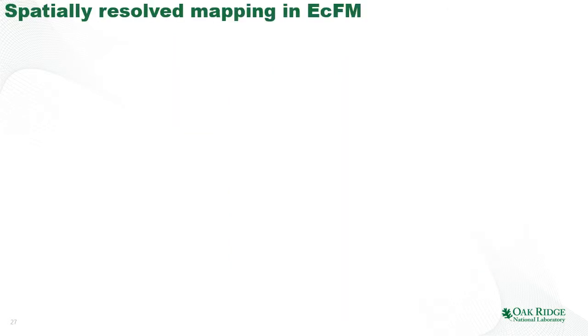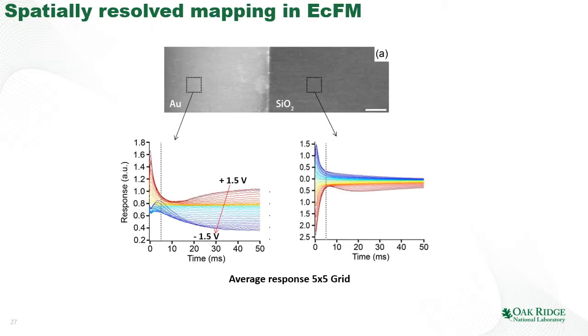Question is, can we even call this method microscopy? What I've shown you is an example of single point measurements, and as I said, at some point the process starts to result in bubbling. Can we do spatially resolved measurements?